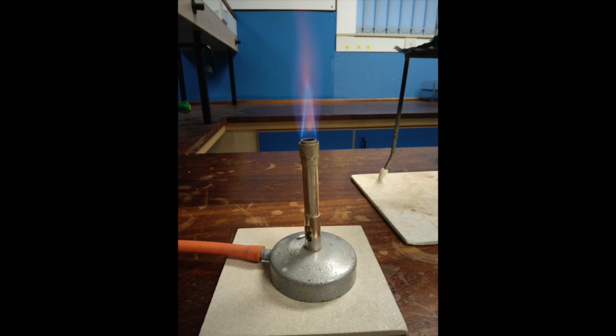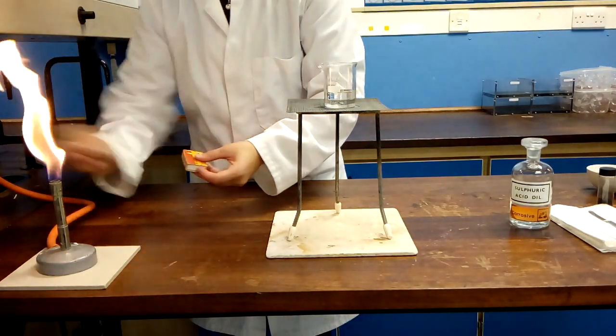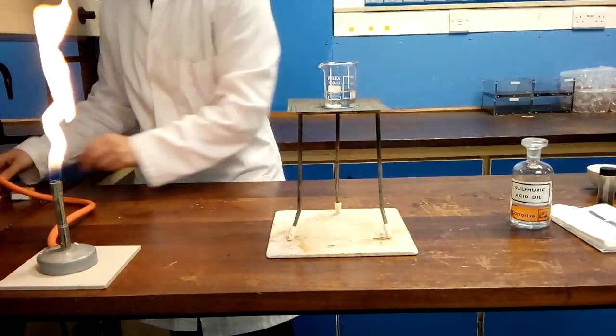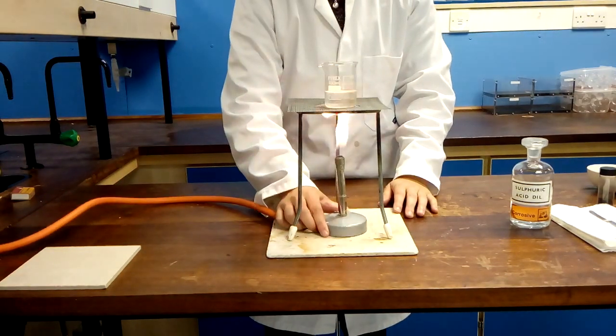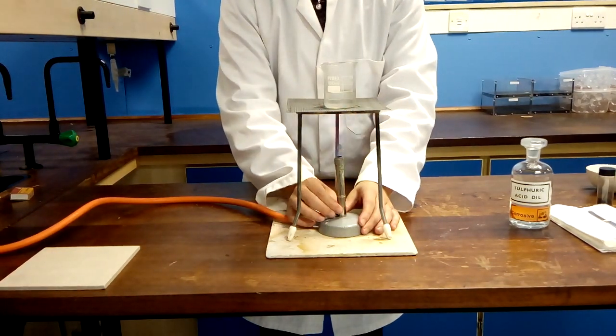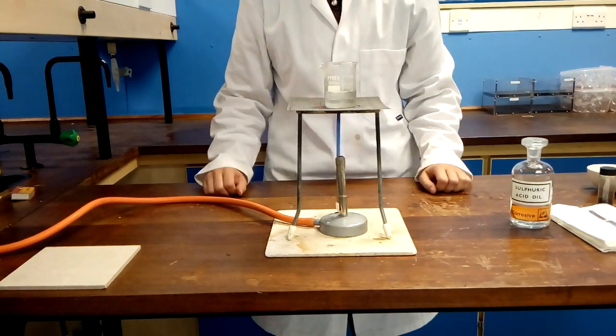When you open the collar the Bunsen turns to a blue heating flame which is much hotter. Turn the gas on and light the Bunsen. It is important to position the Bunsen between the legs of the tripod so that it can be easily removed. Open the collar and set to the blue heating flame.